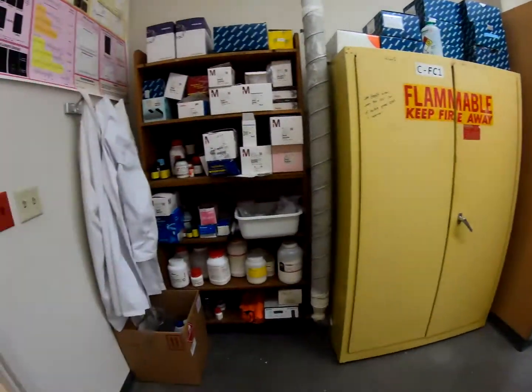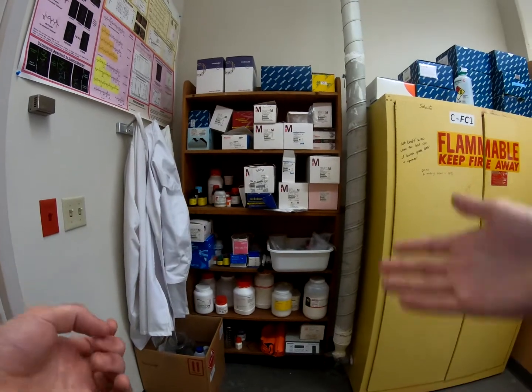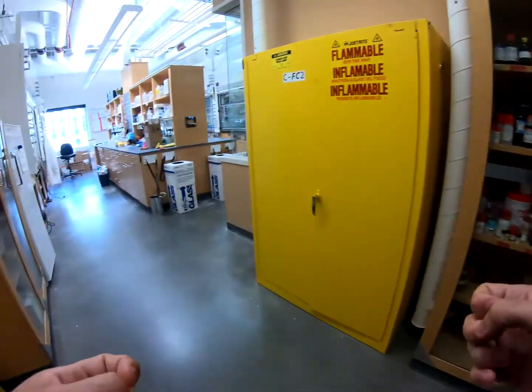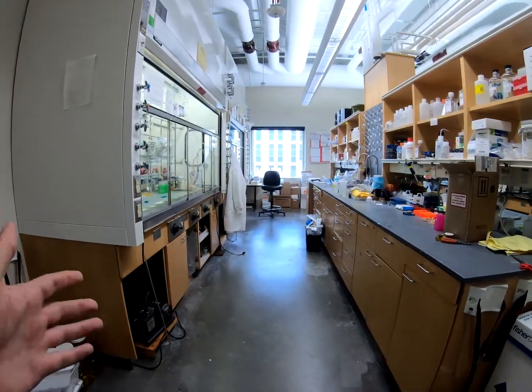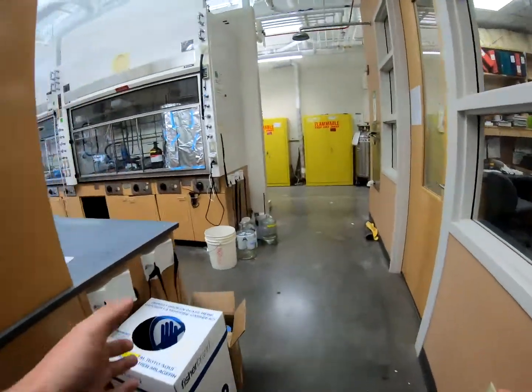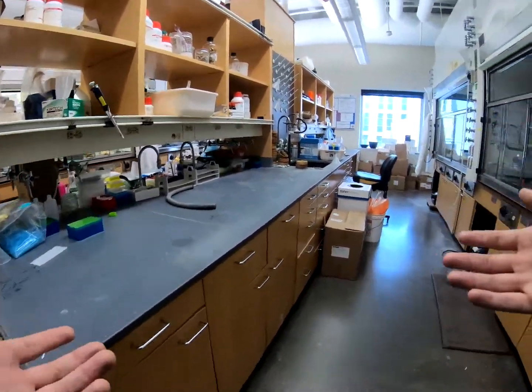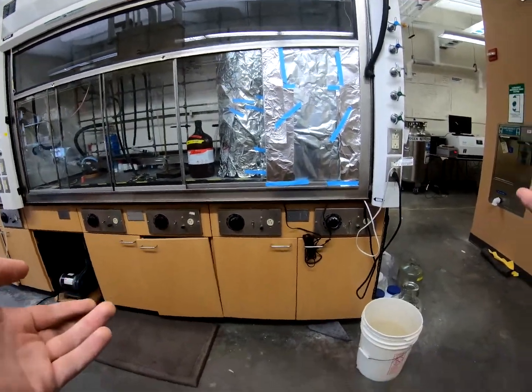As you walk into Lab C, you'll see that we have chemical storage here with common use things such as PCR tubes and centrifuge tubes that a lot of people use in the lab up here, as well as another chemical storage cabinet here. Moving forward, we've got the standard setup where we've got benchtop and fume hood, and then going to the middle lane, the same sort of setup we've been seeing a lot of, the benchtop and fume hood. But this desk is interesting because no one is currently occupying it, so we've actually set up an apparatus to exclude light for our photosensitive reactions.